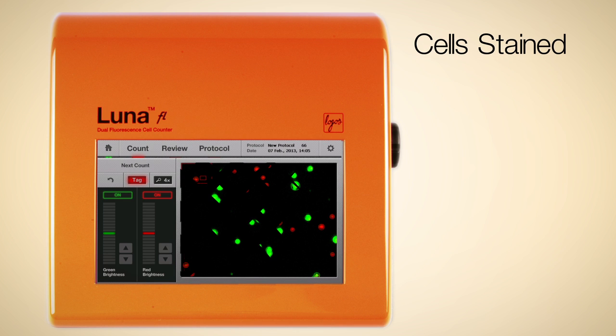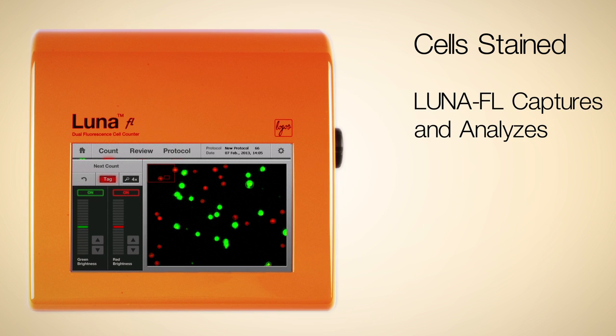Cells are stained with green and red fluorescence dye. The Luna FL captures and analyzes three different images: bright-field, green fluorescence, and red fluorescence.